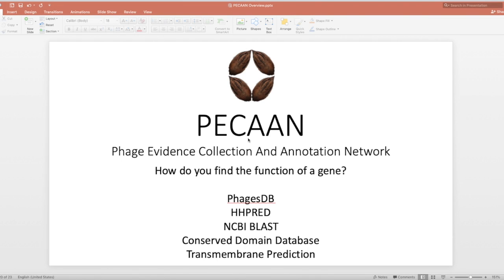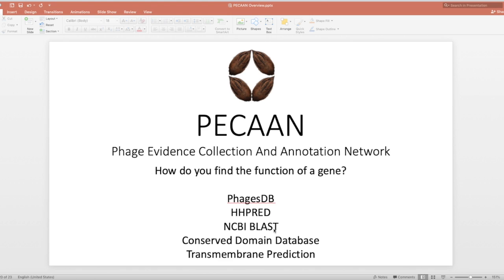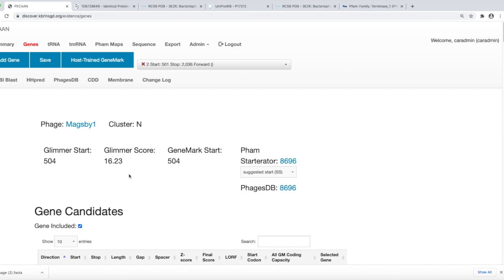Welcome to the PECAAN tutorial about how to find the function of your gene. To find the function of the gene, PECAAN has downloaded the top 100 hits to various databases, including PhagesDB, HHPRED, NCBI BLAST, Conserved Domain Database, and two different transmembrane prediction programs.